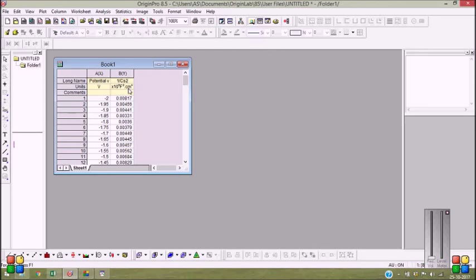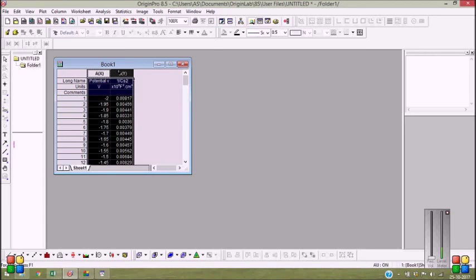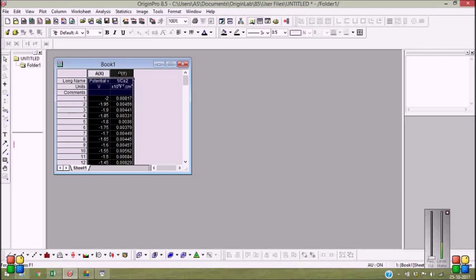So I think you have understood the matter. As I have the electrode area 1 square centimeter, I do not have to multiply with the area square. However, if you have area other than 1, then you must multiply column B or the y-axis with the square of the area to make things dimensionally correct.